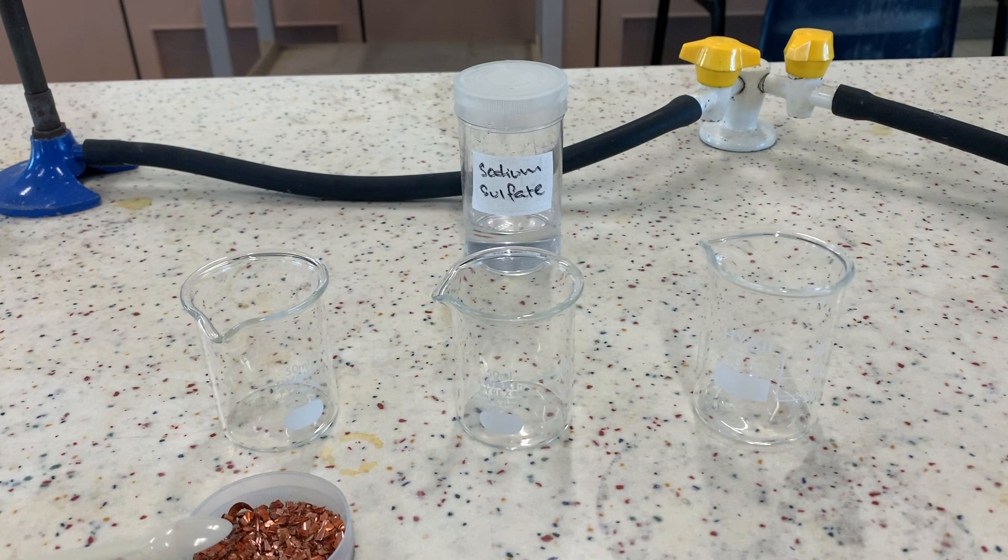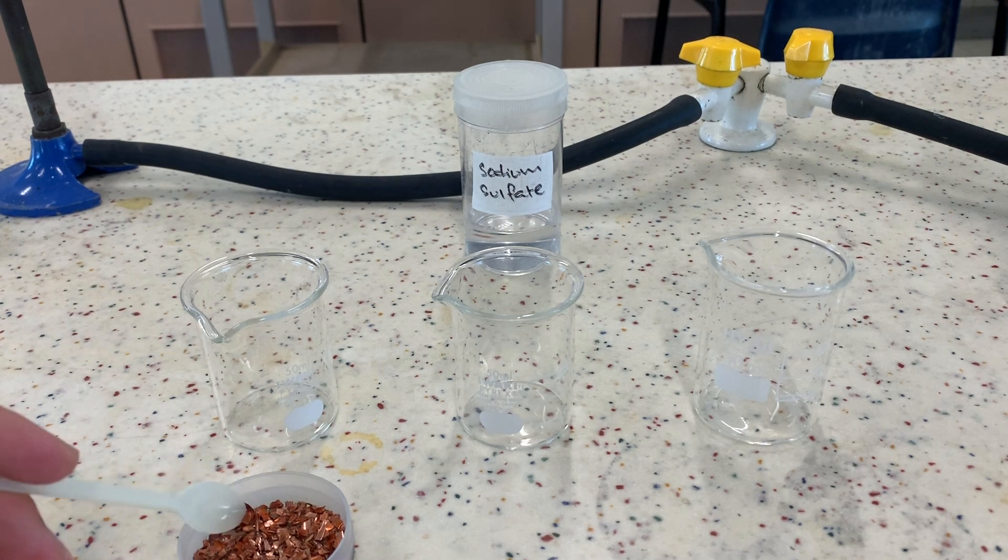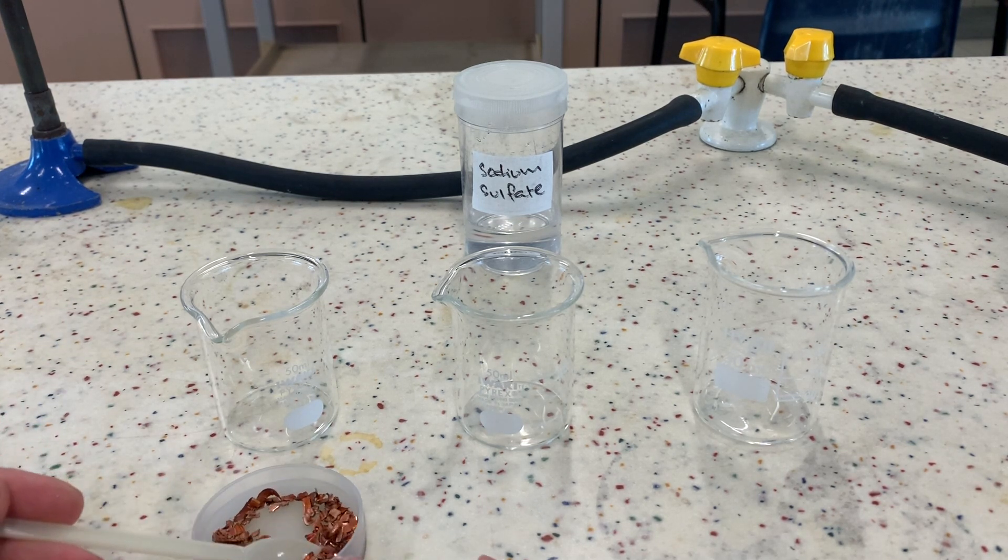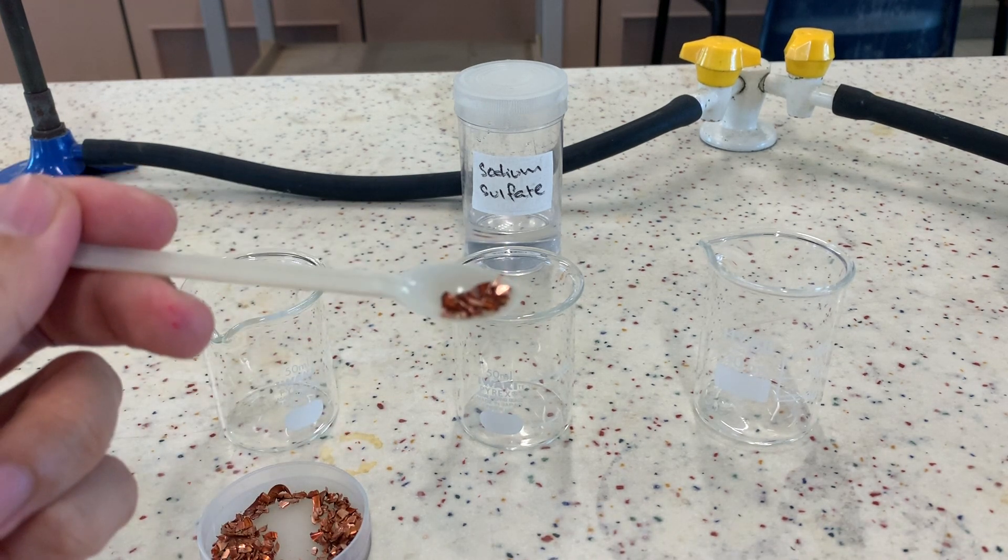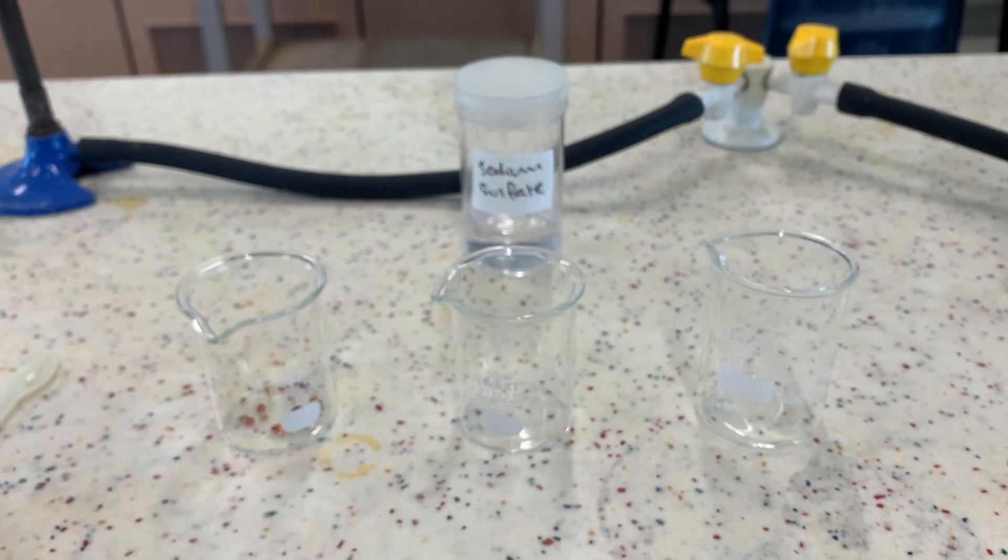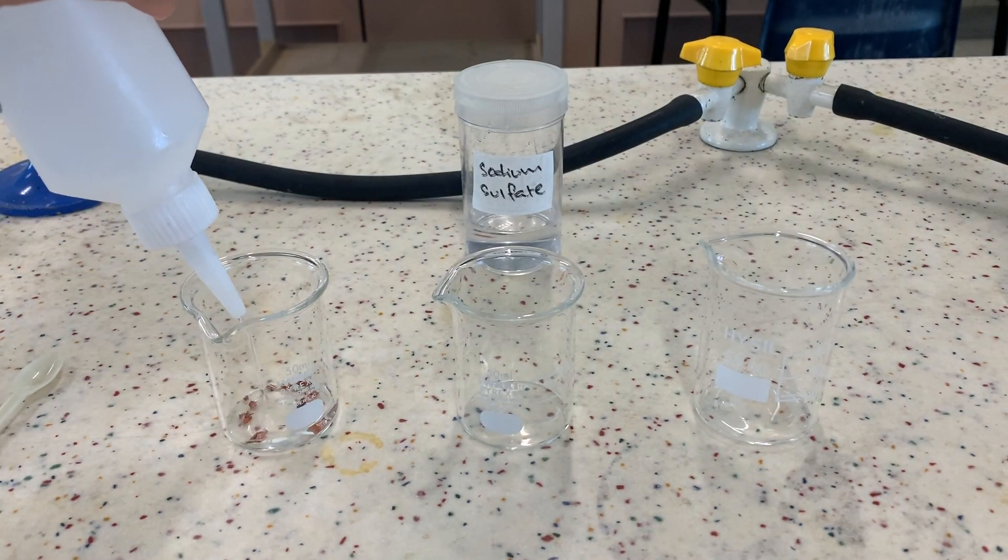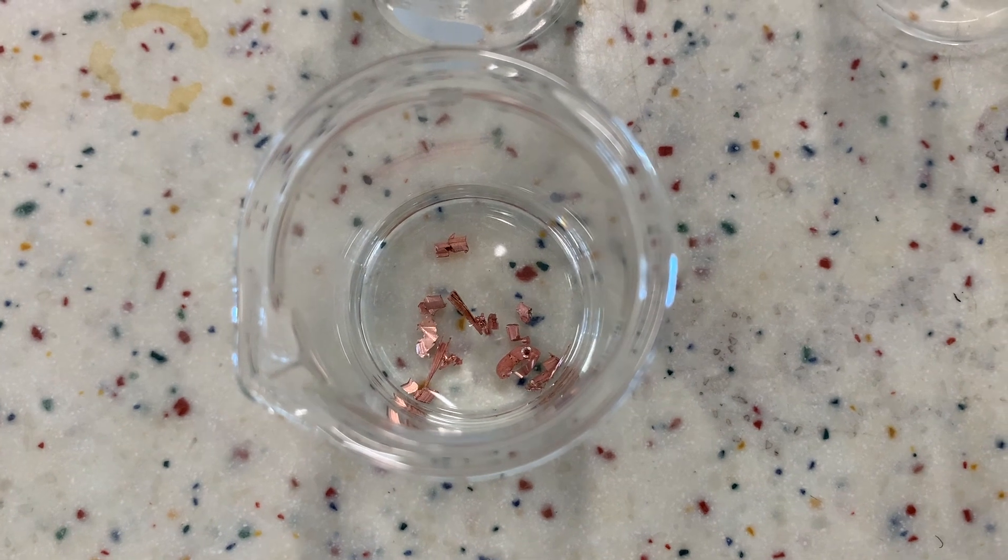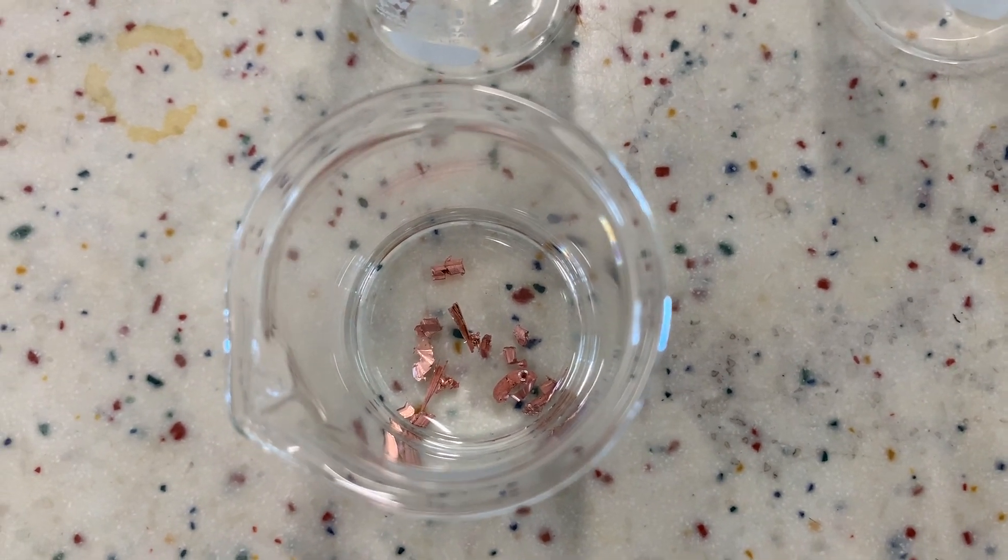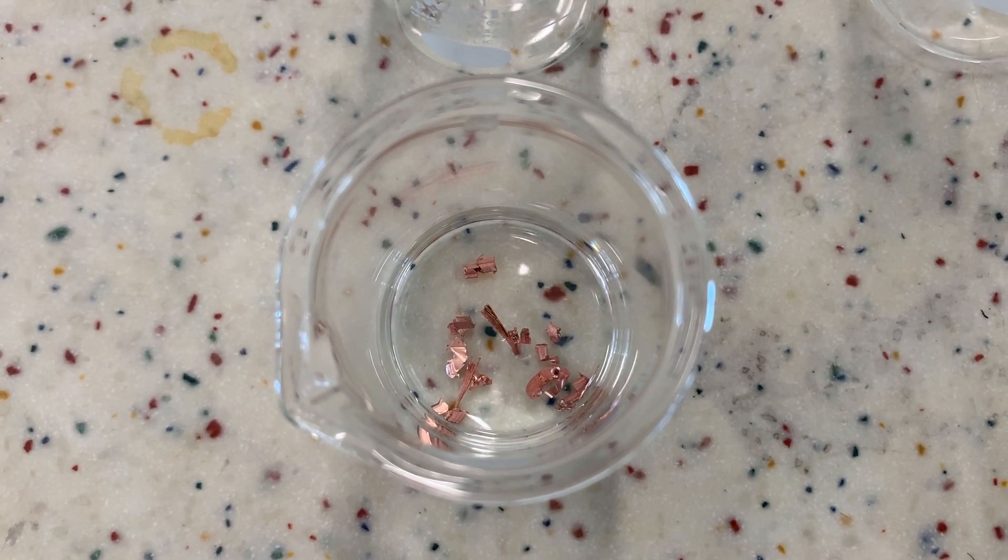Over here we're going to test out different combinations of reactants and see which one works the best. We are going to use the predict, observe, explain thinking routine again. Before I carry out the reaction, I would like you to think whether a reaction would take place and what you think you might see. The first combination that we are going to test out involves pieces of copper. I'm going to add that to a beaker, and to that, I'm going to add some sulfuric acid. Well, it seems like there is no visible reaction. There's no evidence of any bubbling at all. And that's because copper is an unreactive metal and it doesn't react with sulfuric acid.